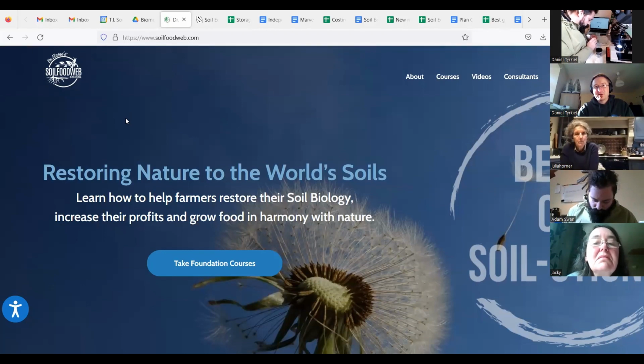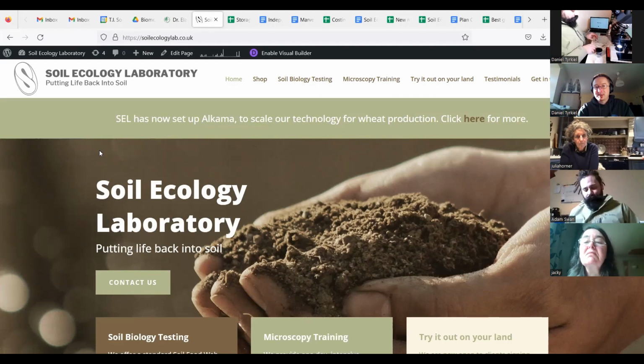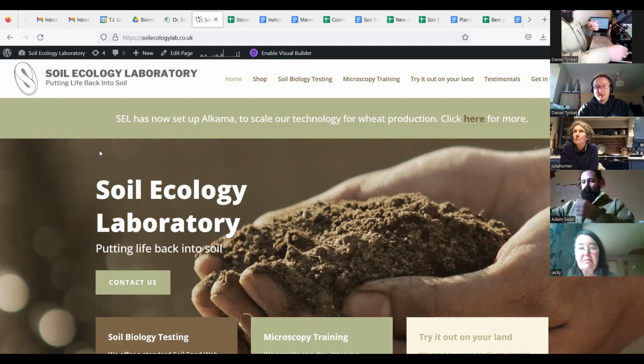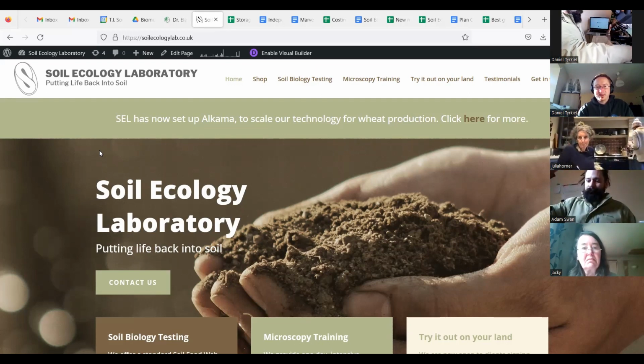We're not affiliated from the perspective of the school, but this is basically where we start from. And we actually try to keep a good relationship with them, because it's important for us to keep some standards. Direct microscopy, which is taught by Dr. Ingham, was developed by her as a technique for farmers to quickly assess their soils or compost that they work with, to get an understanding with some relatively inexpensive tools of what the biology is doing in the soil, because you can actually spend quite a lot of money on testing, and I will touch on that later.